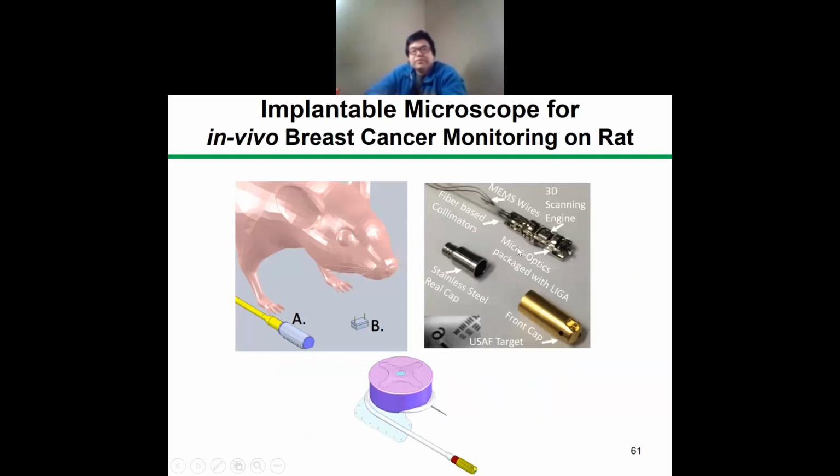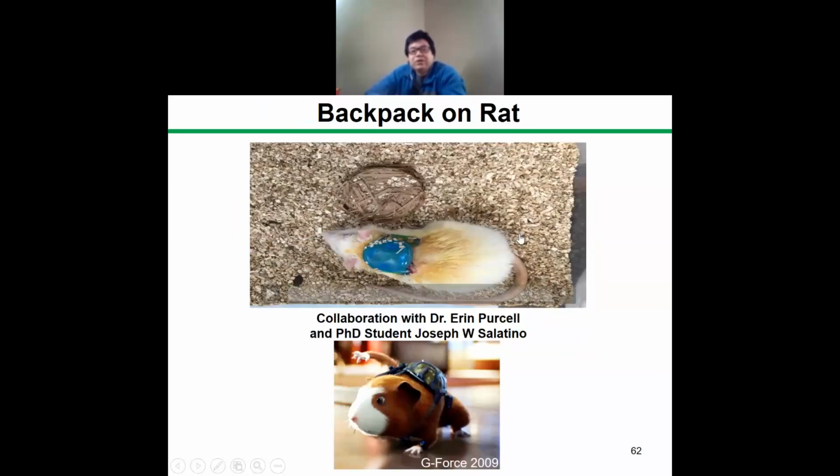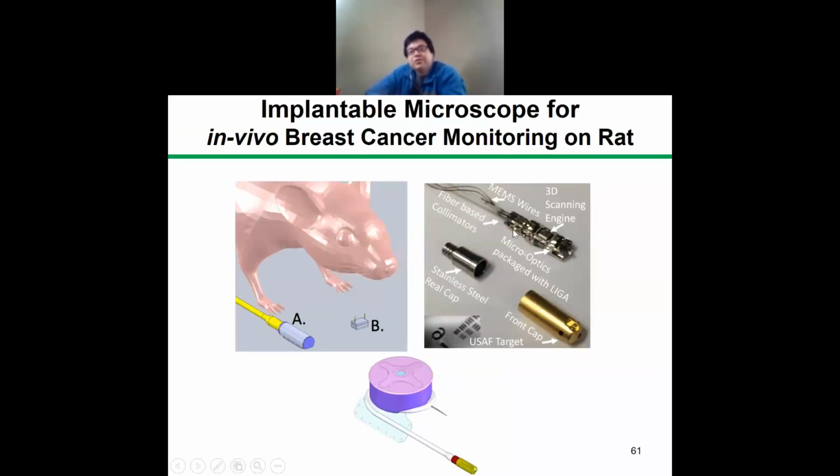So this is a system where we use the technology from Germany and Switzerland, the way they make high-end watches, called LIGA. So these are parts we made out of LIGA parts and integrated everything like Lego. Then the MEMS engine is inserted in the middle, and we also have a custom-made housing. This housing has arbitrary geometry. So when we put everything together like Lego parts, you get alignment free. Because optical mechanical packaging is so challenging, you get alignment free.